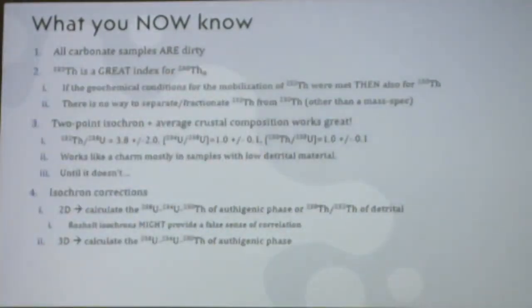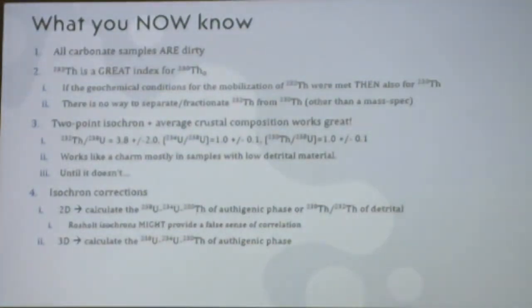If that's not the case, you have to do an isochron. What most people I've worked with actually do is, if their samples have a lot of thorium, they give up. Why bother? I'm not like that. I like geochronological challenges, so I recommend working with the isochron corrections and getting into it. So now you have to build an age model.